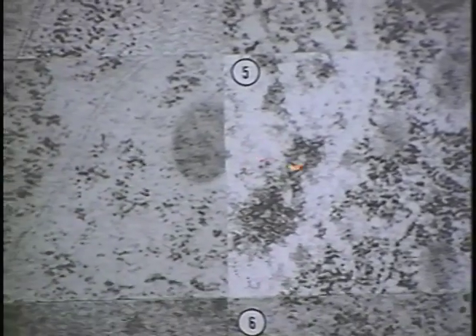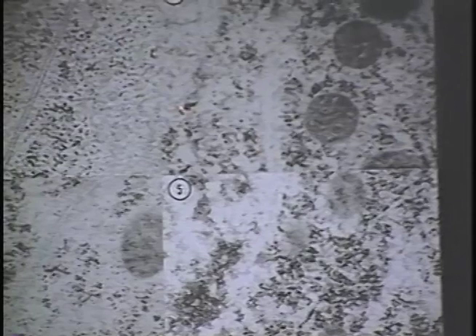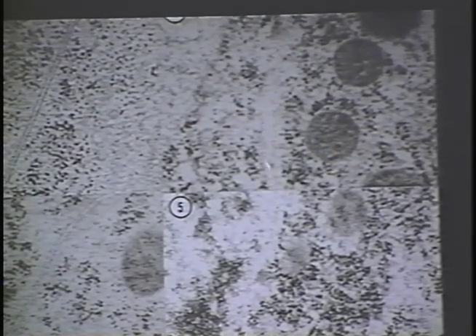However, the tissue that was freeze substituted in methanol or glutaraldehyde and acetone had a general extraction of the cytoplasm and no clear definition of membranes. Here are two adjacent cells, and you can't really resolve the membranes between the two cells.